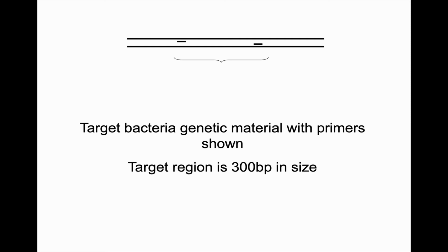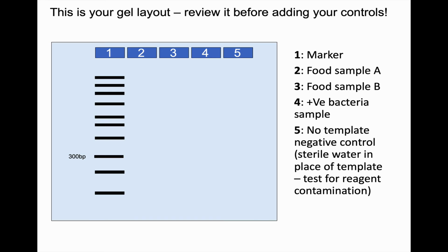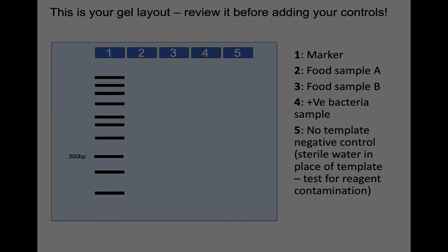Right? That's where the primers are designed, 300 base pairs away from each other, and that's the size that'll be amplified if the target is detected. Okay, so please press pause, give that a go, and come back and press play in a few moments' time.